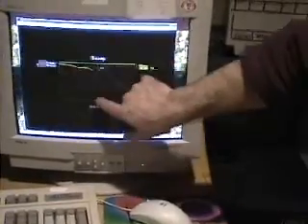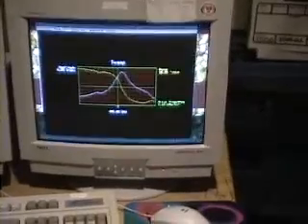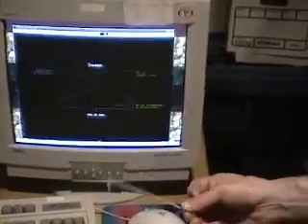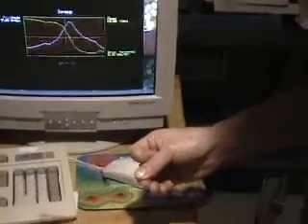So you might think, well, I want to position that so it's right at the peak of the resonant response, so that I get the maximum bang for my buck in terms of a lot of oscillation amplitude at the tip where I care about it, and a minimum oscillation amplitude down at the base so that I'm not shaking the whole AFM.